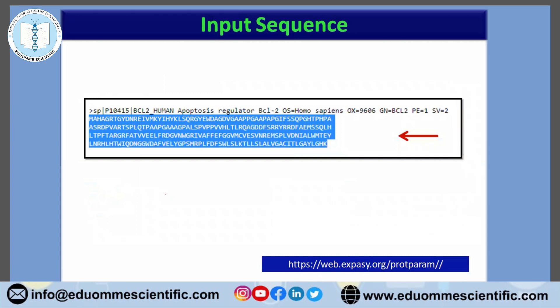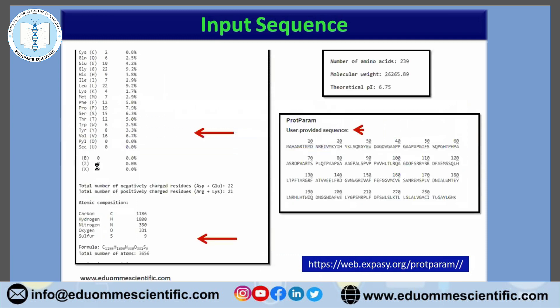So either you get your protein sequence from NCBI protein or UniProt first. Then this sequence — if they are asking for a FASTA sequence, then with the header, we have to take it. Otherwise, if they are asking for a plain sequence, then we have to copy and paste the sequence information into the ProtParam section. If I'm not wrong, they are asking for plain sequence only.